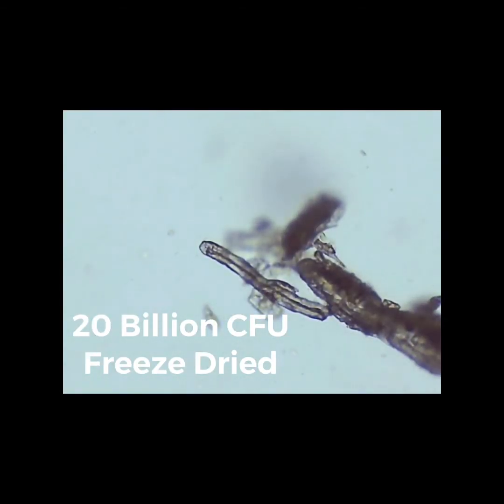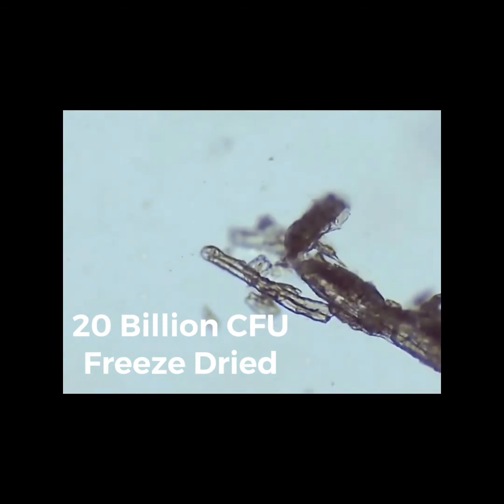Here we have 20 billion CFU of multi-strains. You'll see some movement underneath it and behind it — that's the water because we had a table on carpet, so when you bump it, it starts to move a little bit. But do you see anything wiggling around and swimming with purpose? It's all going with the current. It's a bunch of debris and the bigger things are dead cells. It's all dead material. There probably were 20 billion colony-forming units in the culture, but when it's freeze-dried, they die — the cells are killed. There's extra debris in there from the culture, which could be fecal debris.